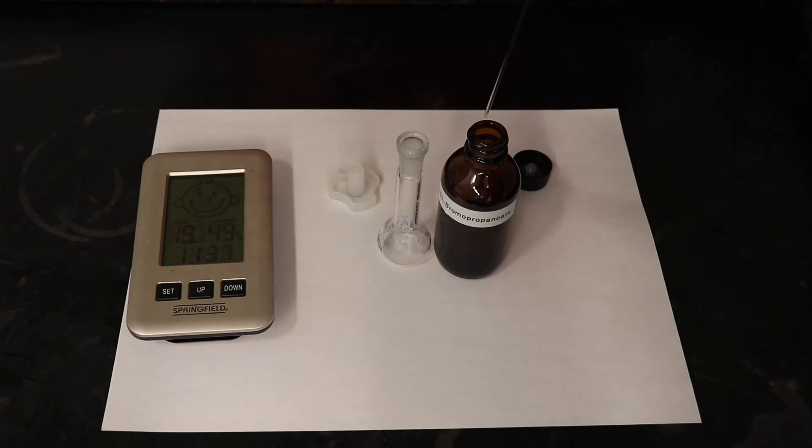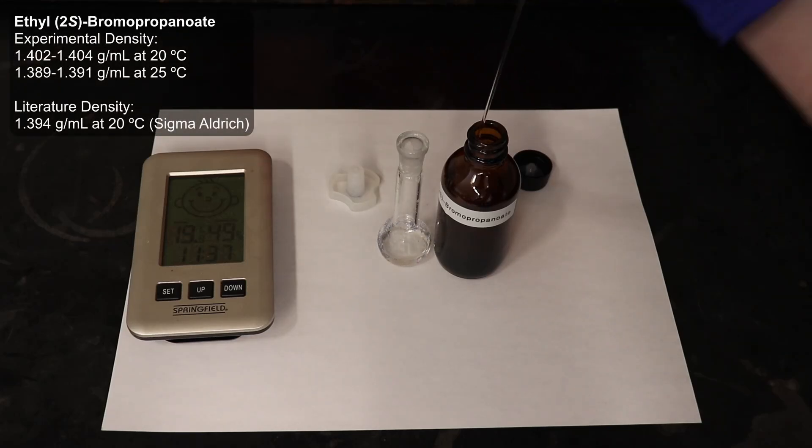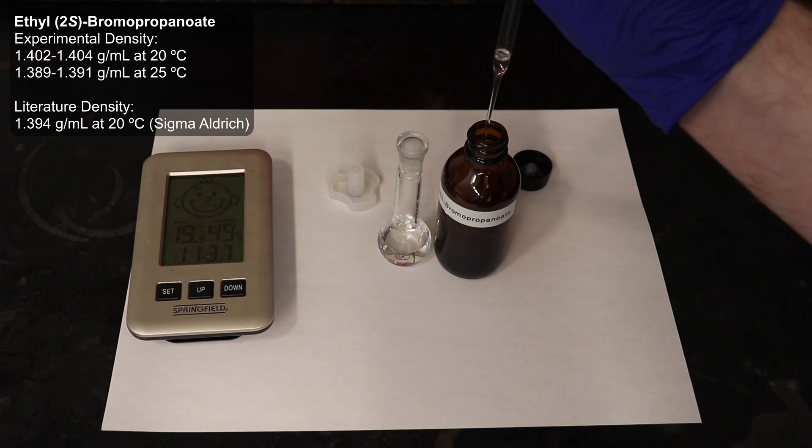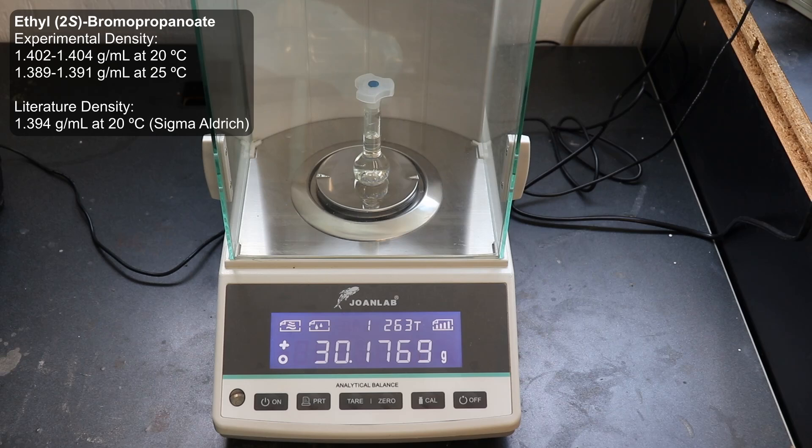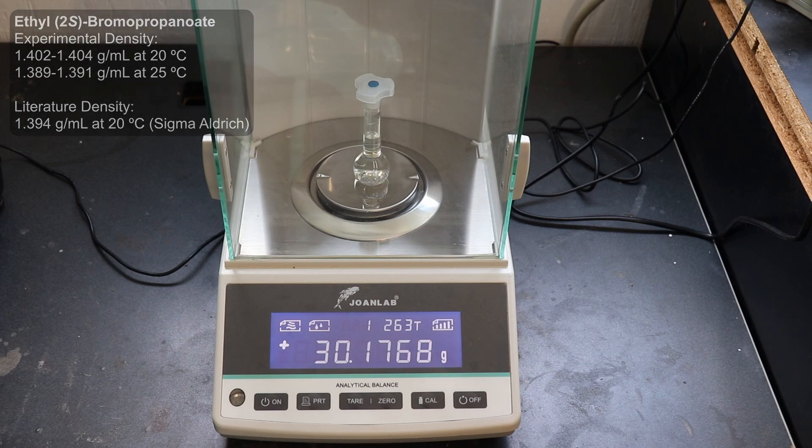I also took a rough measurement of the specific gravity using a 10 mL volumetric flask, finding it to be 1.402 to 1.404 grams per milliliter at 20 degrees Celsius, closely aligned with the 1.394 grams per mL reported by Sigma.